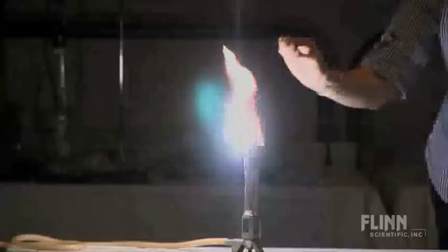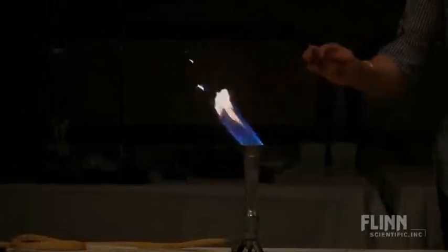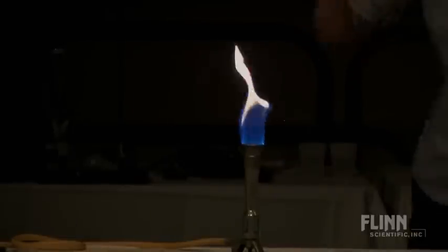So I got to wondering why titanium does that. And the better thing is: where is titanium on the periodic table? Picture iron — we've got to go this way, more towards the edges, which should mean more reactive. Hours you can spend in your classroom doing this, and then when you show it to your kids you have to hide these.